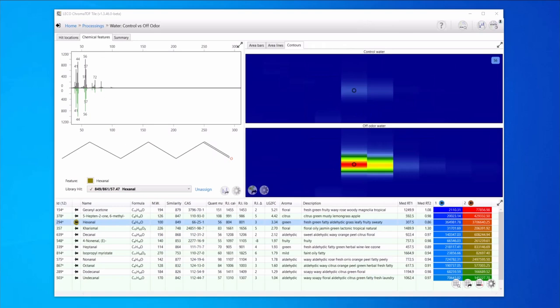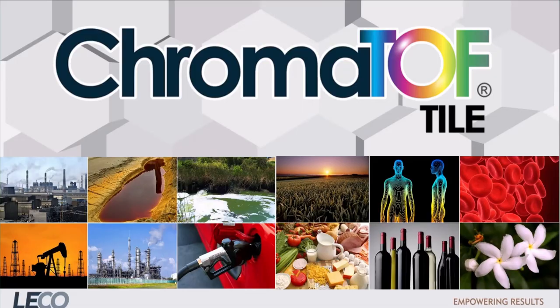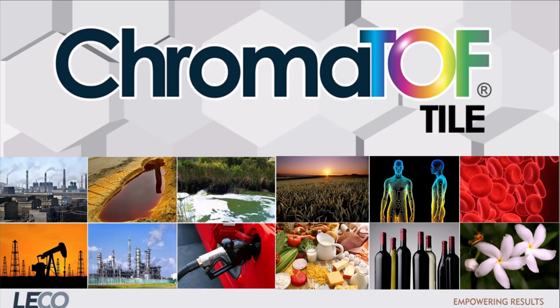ChromaTOF Tile is an efficient way to focus data analysis so that you can quickly find this type of important information about the samples. In this example, we were looking at an off-odor sample compared to a control, but this tool can be applied for many types of samples and experiments with differentiation analysis goals.